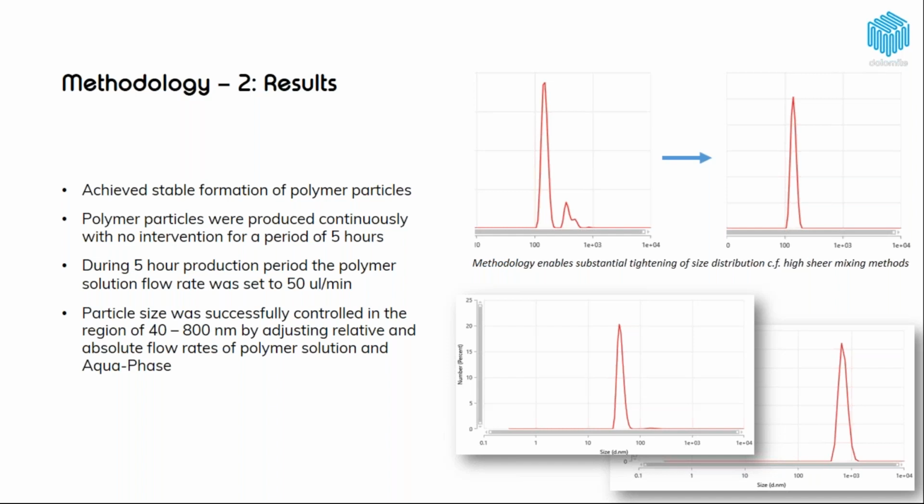You're also increasing the flow rate of droplet phase by 2.5 times. So this is 50 microliters a minute now. And we've been operating these systems for 5 hours continuously with no human intervention. These systems can run in low pressure, so 200, 300 millibar on the set to pressure pumps, but the way we actually recommend to drive these systems is in high pressure mode, so 2, 3 bar.